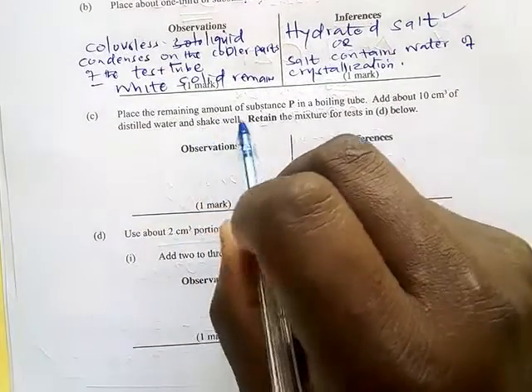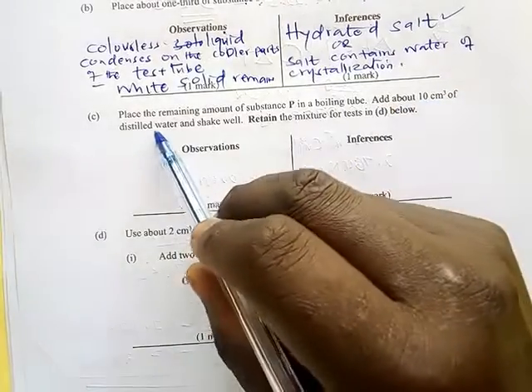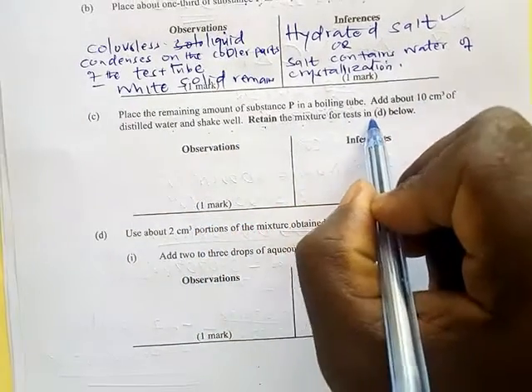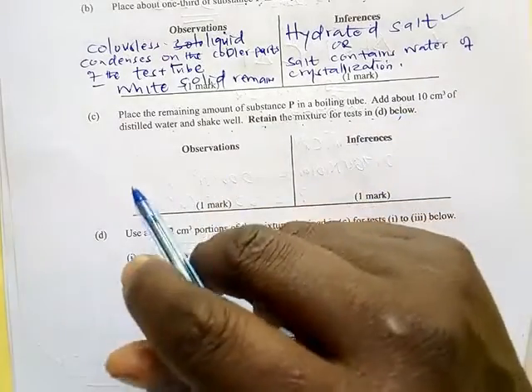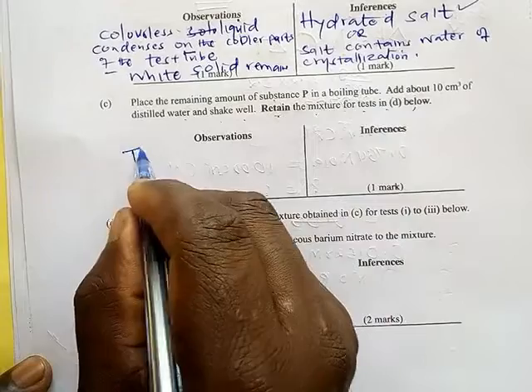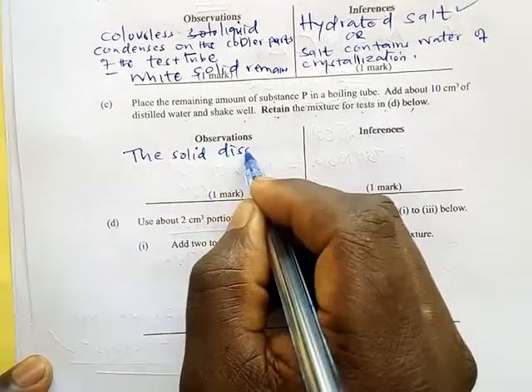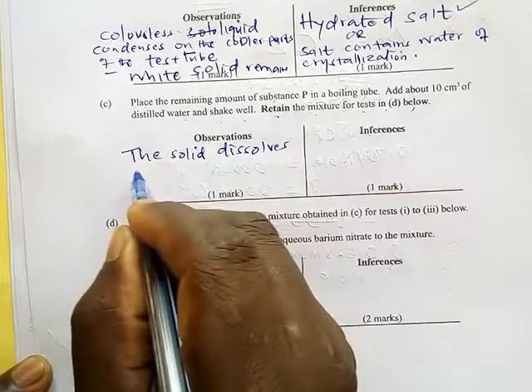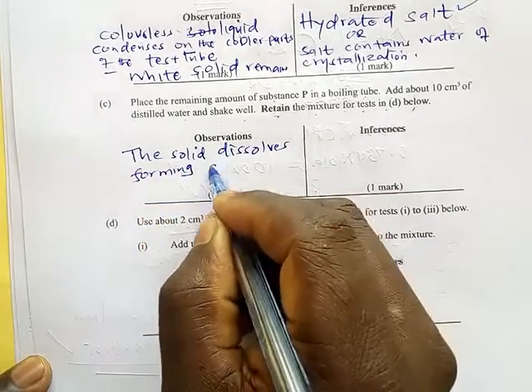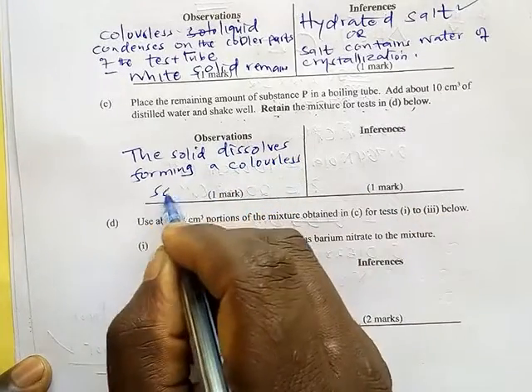Place the remaining amount of solid P in a boiling tube. Add about 10 cm³ of distilled water and shake well. Retain the mixture for test D below. So this one, the solid, dissolves to form a colorless solution.